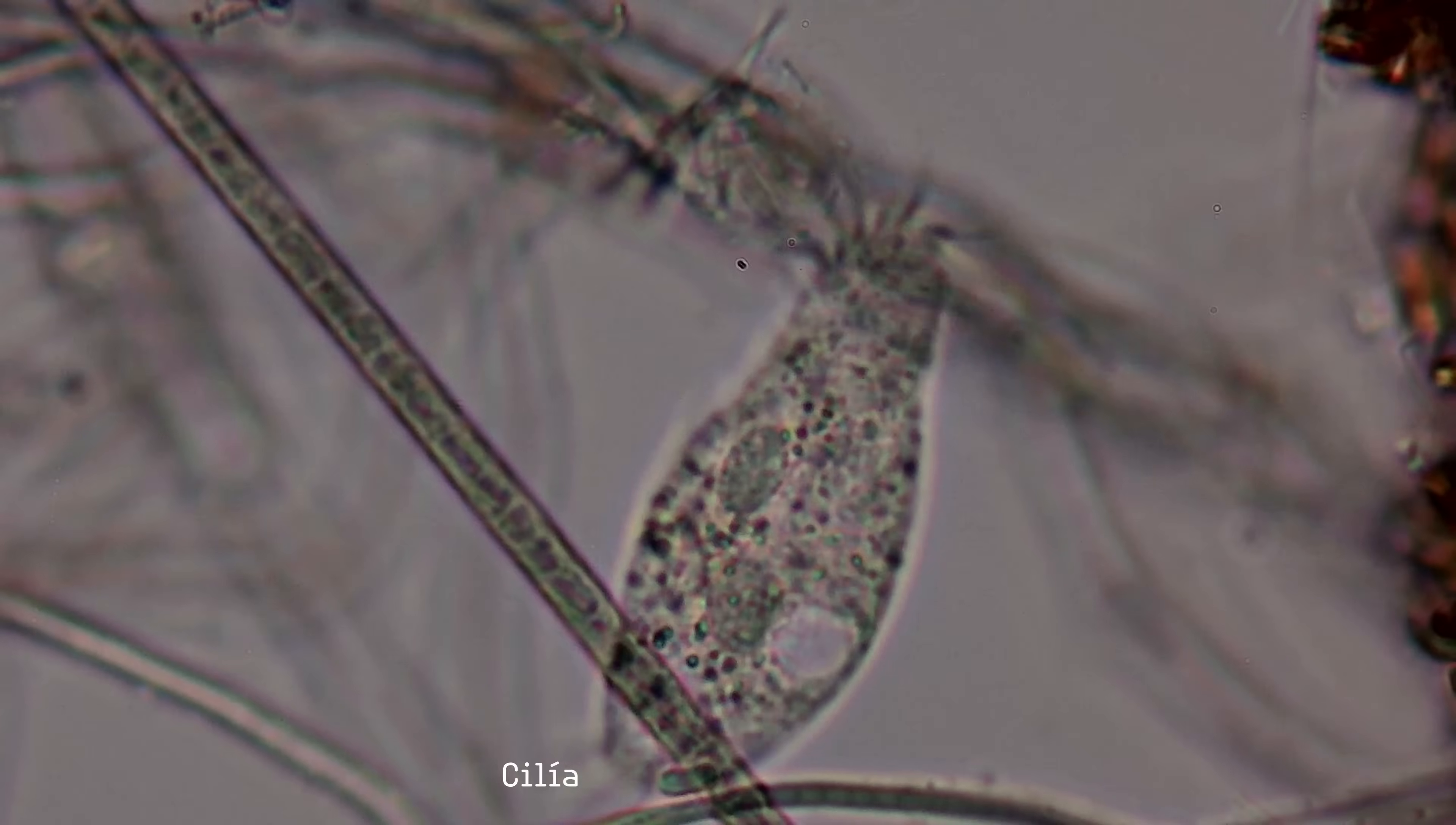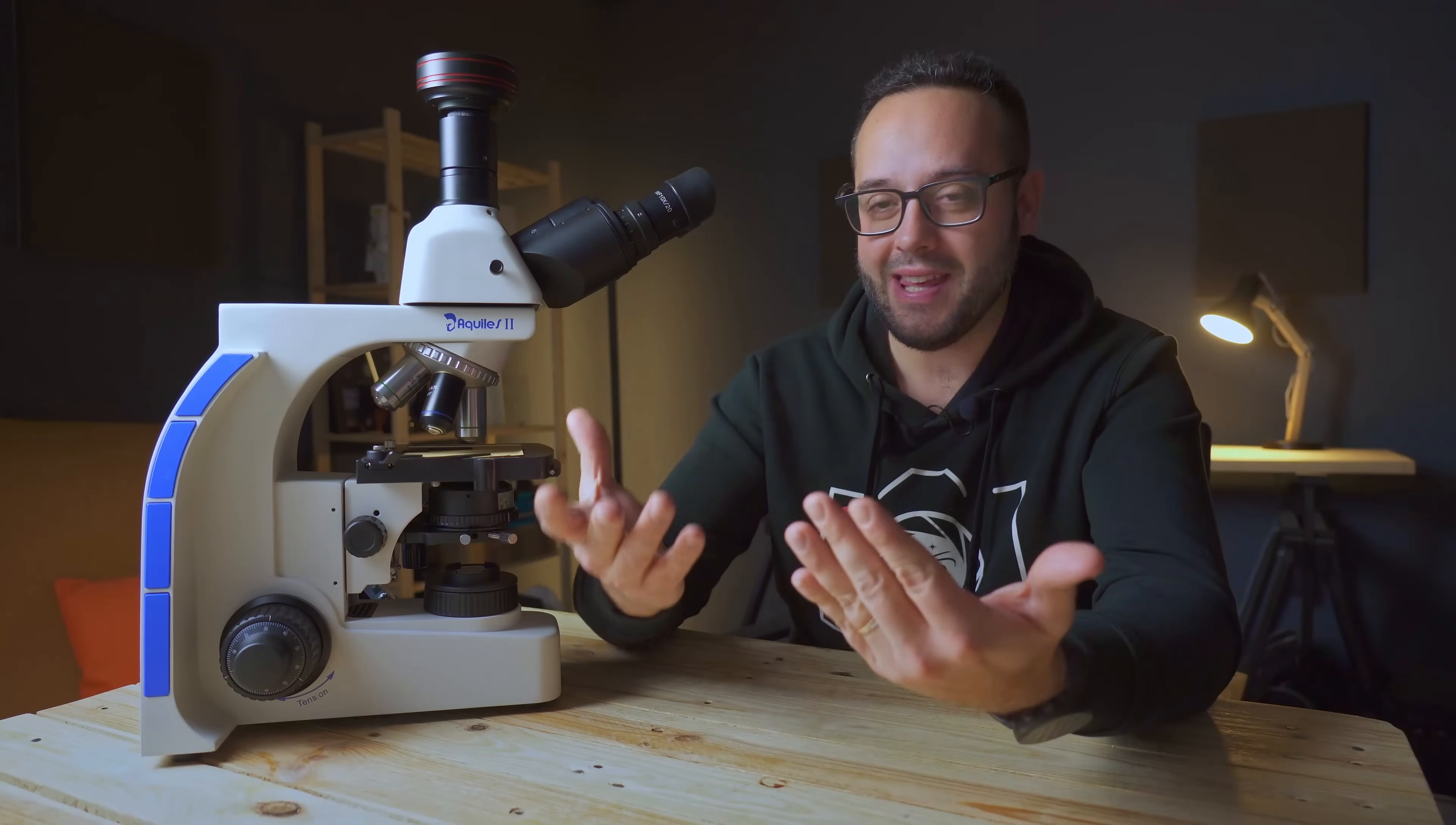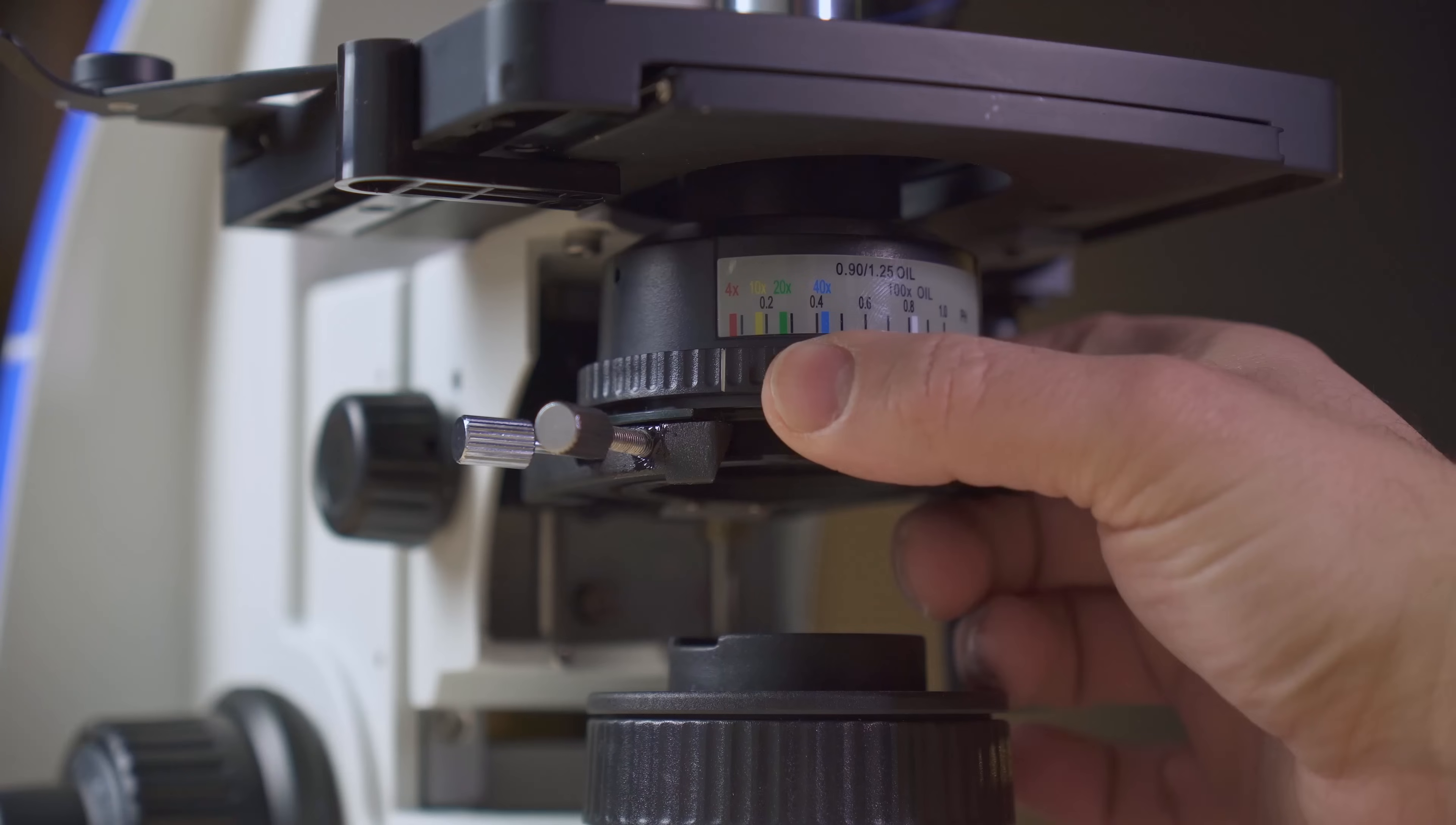In addition to bright field microphotography, which is the most common and best known in the world of microscopy, this microscope also has a phase condenser. Basically, this element that functions as a kind of diaphragm and is right here, allows us to practice microscopy and microphotography in phase contrast, dark field, and with oblique illumination.